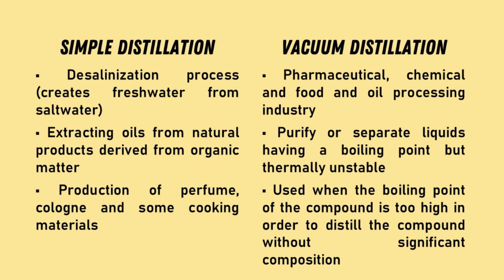It is used to purify or separate liquids having a boiling point but thermally unstable. It is also used when the boiling point of the compound or the solvent is too high in order to distill the compound without significant decomposition.